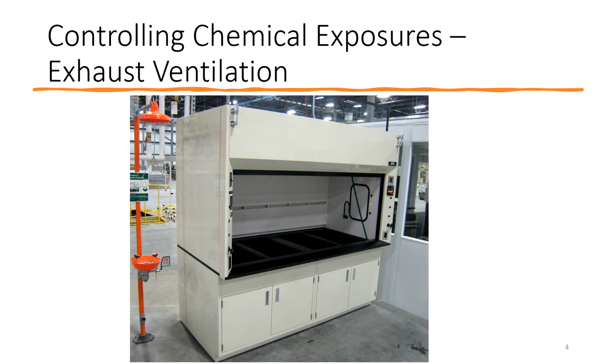There's going to be glass that can come down on the front, typically in the form of a sash. Depending upon what you're doing with this experiment, a lot of times you can lower the sash to help pick up the velocity of air that's going through. It does a very good job of making sure that these not only don't come in contact with humans, but they're not even released out into the workforce.